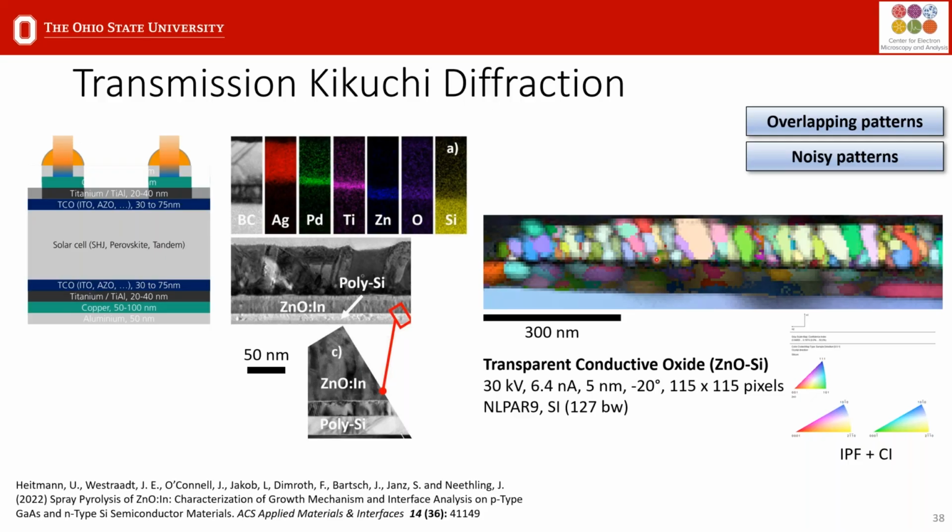That's probably where it's heading in the future: going directly from the patterns from the detector, indexing with spherical indexing directly, skipping the Hough indexing step. Then you don't have to save all these patterns and work with these ginormous data sets. Yeah, I'd concur with that.